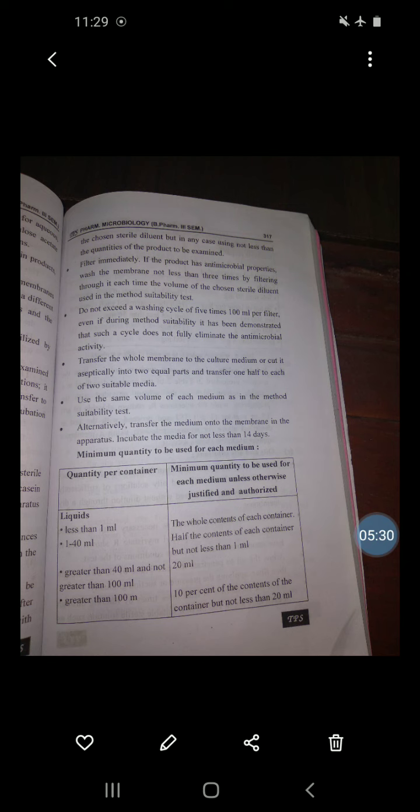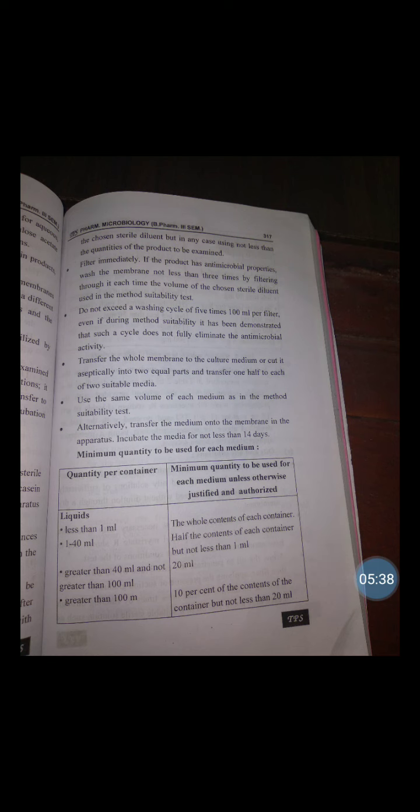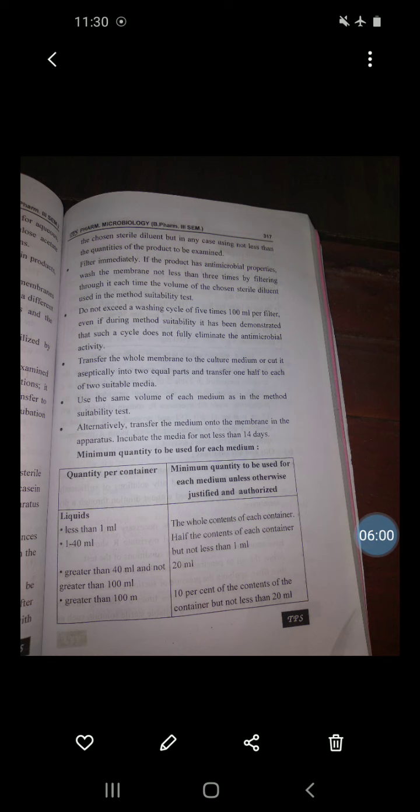We will see in the chart here. The chart shows the minimum quantity to be used for each medium. The first column shows the quantity per container, and the second the minimum quantity to be used for each medium, unless otherwise justified and authorized. First, liquids: less than 1 ml, the whole content of each container. Then 1 to 40 ml, half the content of each container but not less than 1 ml.